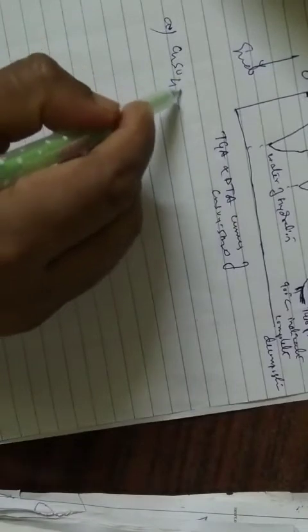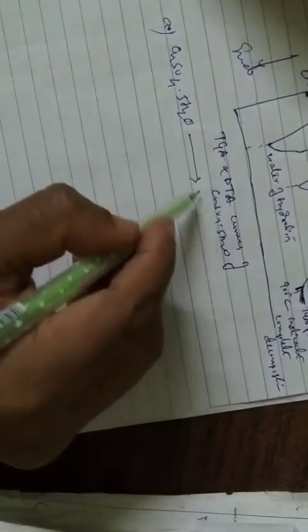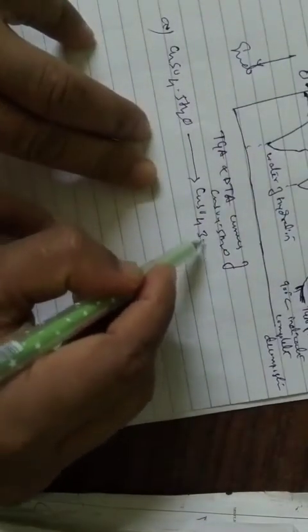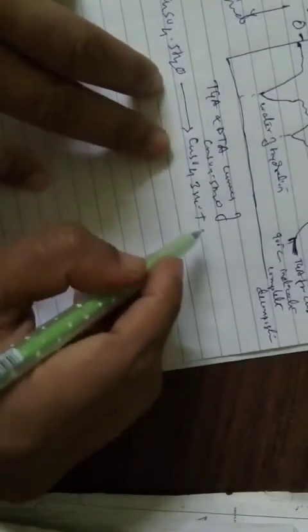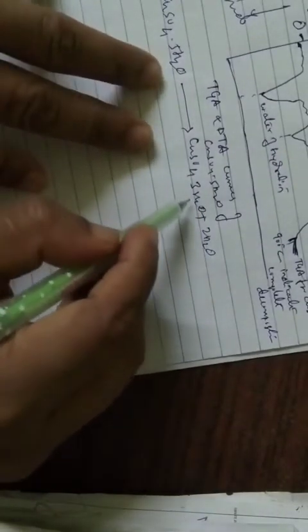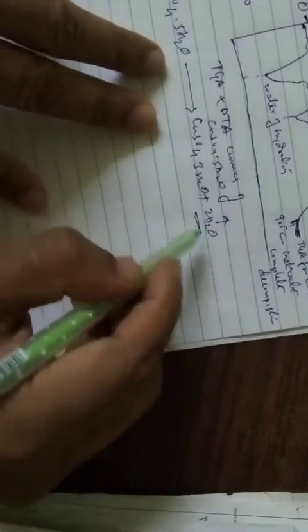Now you can see two peaks here, as we have learned in the previous video, that the copper sulfate pentahydrate you are taking is going to change into copper sulfate, okay. So 3H2O plus 2H2O. So here 3H2O and 2H2O are going to leave in the form of steam here.